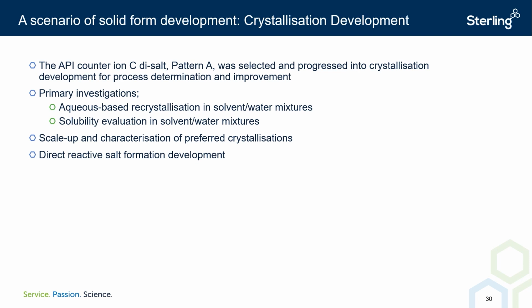of the API salt. However, instead of generating the salt and recrystallizing it, or indeed crystallizing a free API and then generating a salt, a more efficient process would be a direct reactive salt formation driven crystallization. An investigation was therefore launched into targeting a one-step isolation of the API salt with desirable properties from crude free API.